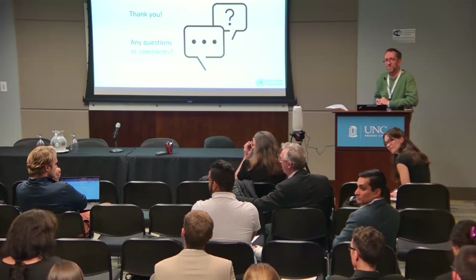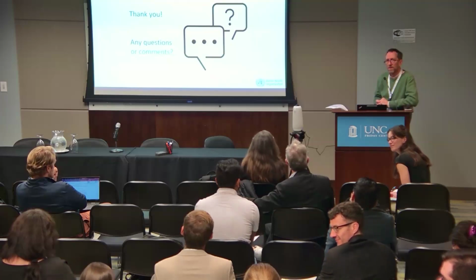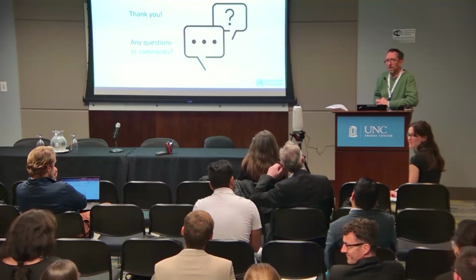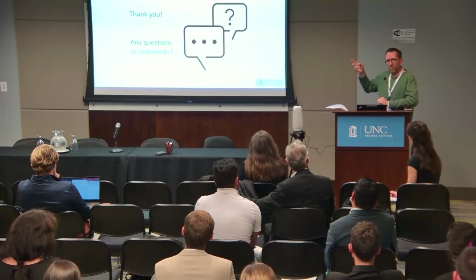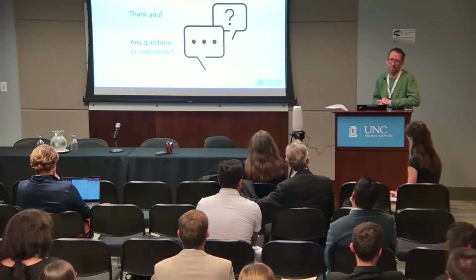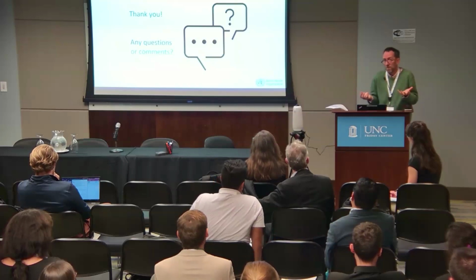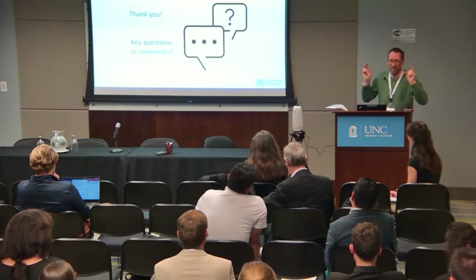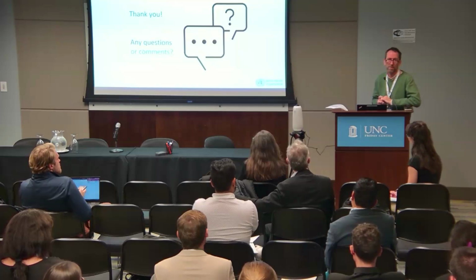Did you find these results discouraging, or would you say that you were encouraged by the availability of all the different methods? What would you recommend for future developers? Well, I think we were initially discouraged, especially by this smearing problem, because a lot of the samples were unusable. And we thought, my gosh, is this happening a lot in the field? But then when we spoke with people and learned that they weren't actually coming across that problem, or maybe if you have come across the smeared colony problem, let me know. It seemed that in practice that wasn't so much of a problem, so we felt a little bit reassured about that.